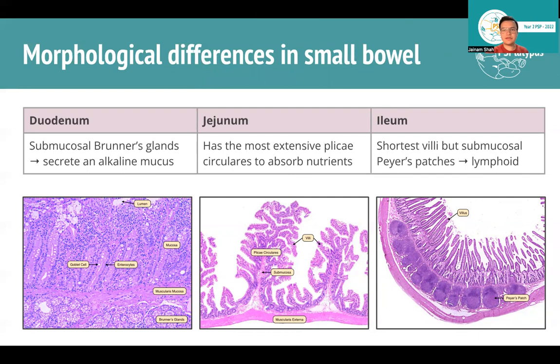The main thing that the ileum does is actually a lot of immune roles. And so you've got these things called Peyer's patches, which are really, really easy to see on histology. If you get a picture like this, where you've got a wall of a particular lumen, and it's got these really dark patches on the outside, as the name suggests, Peyer's patches. So they contain a lot of lymphoid tissue to deal with infections of the gut.